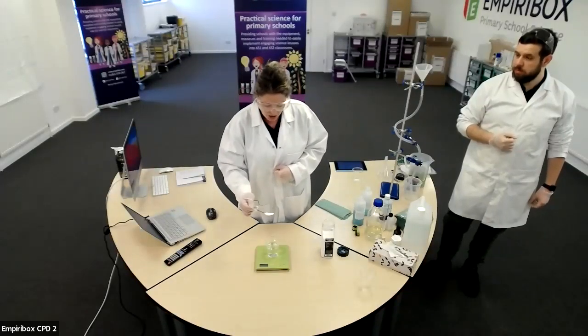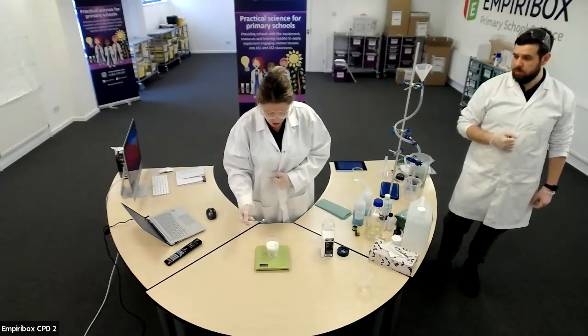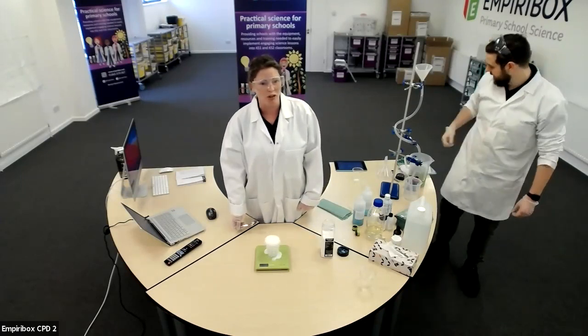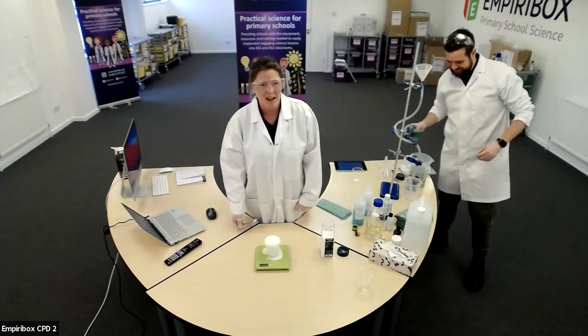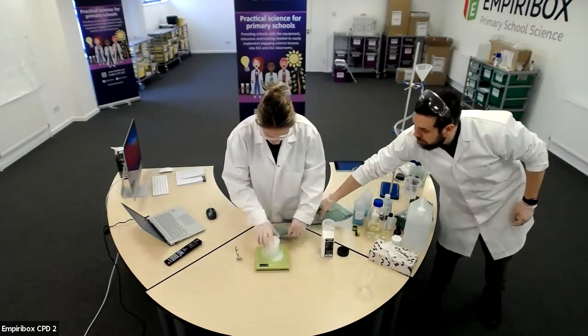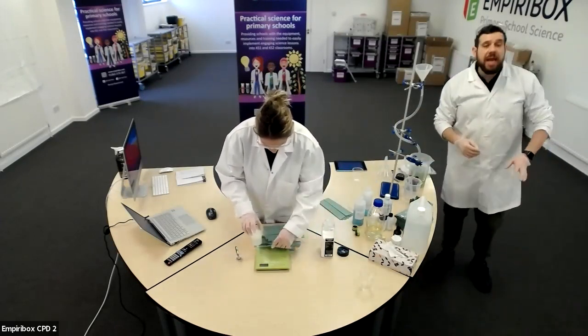So in your reaction then, what you'll do is pop your chemicals together so that you get a reaction, and then we are observing what takes place. Oh, my beaker is... Every single experiment I do goes wrong, doesn't it? So mine has bubbled all over the top and is making a complete mess all over the table. That's okay. It happens.